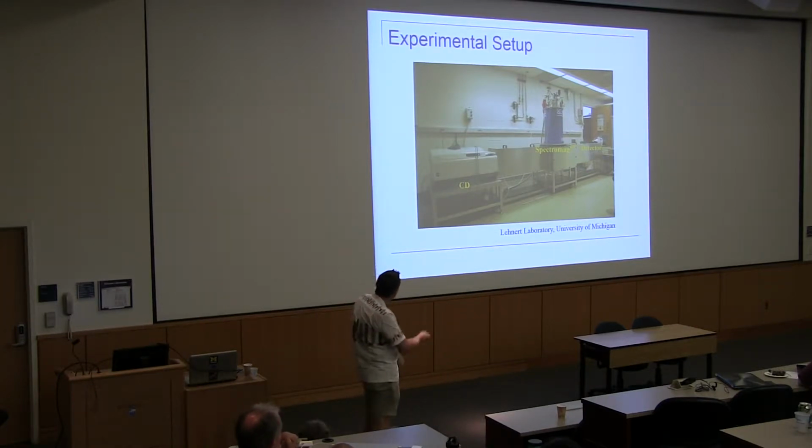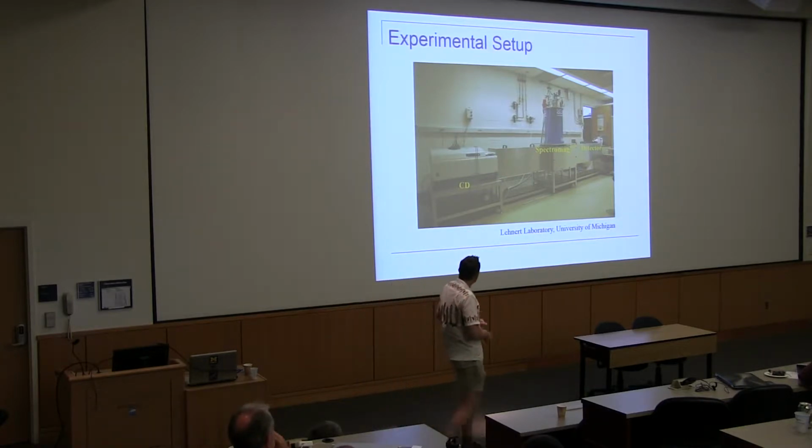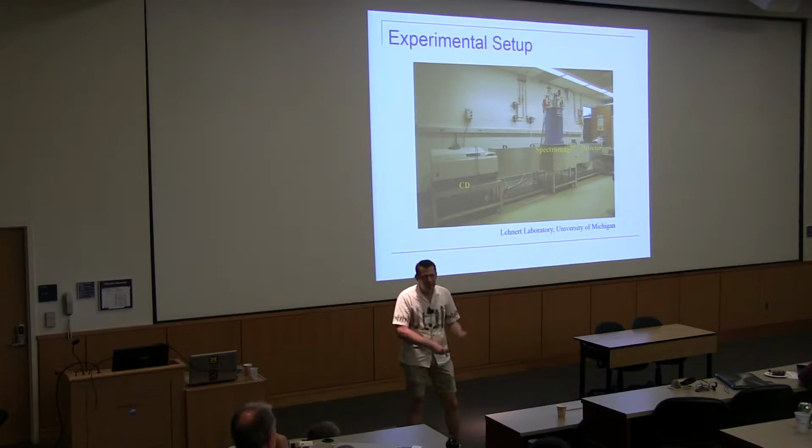And then we also built this coffin around it, so you can run your experiment, because you have the beam just traveling as an open beam through this box here, but you can have the light on while you run the experiment. So this whole setup is really just dictated by these practicalities.